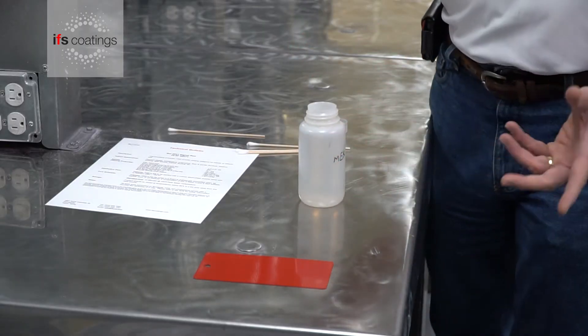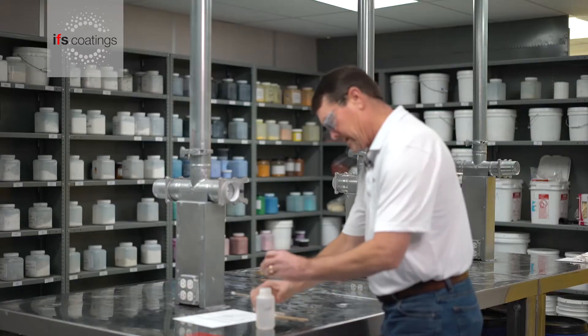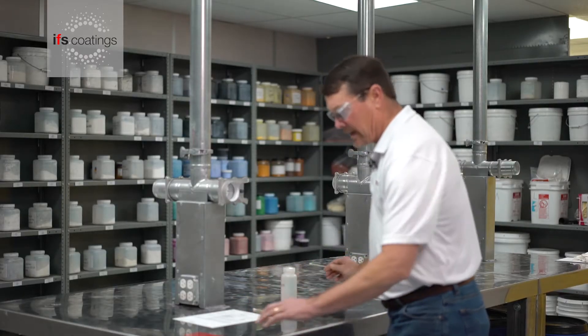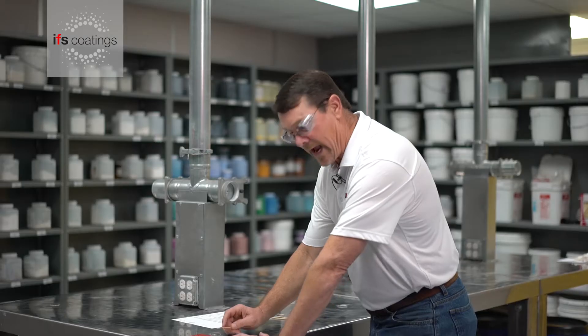Using this bottle of MEK, we will dip our Q-tip into the solvent and then, holding the panel, we will do a back and forth motion.